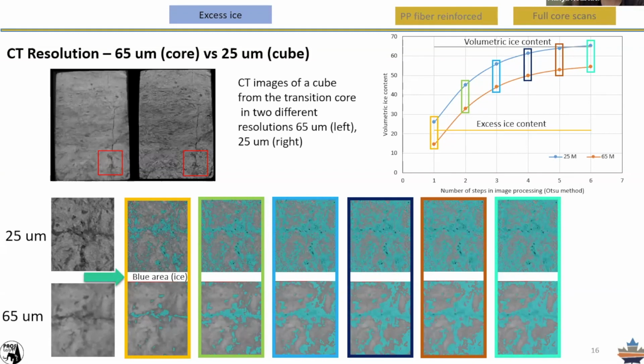We can just talk about the 2D one if we want to compare it with what we are getting from the boreholes, because everything will be done at site. So everything will be 2D, just by visualization of the core. So we were thinking about adding a big database of the different materials, the different cryostructures, and different ice contents. It might be a good way of upscaling these results. But right now, we don't have any option for that. But definitely, we should go for scanning lots of cores.